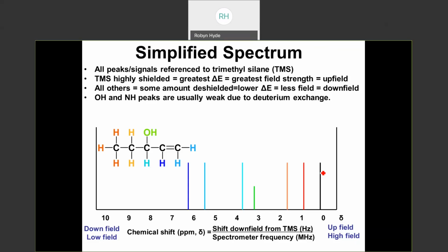So now I've color-coded everything. We talked about in my example molecule, those red protons are the most shielded. And so then I placed those red protons at 1. So protected CH3 protons are almost always found at 1. And so just like with IR, we're going to think of bands of where we expect data to fall.